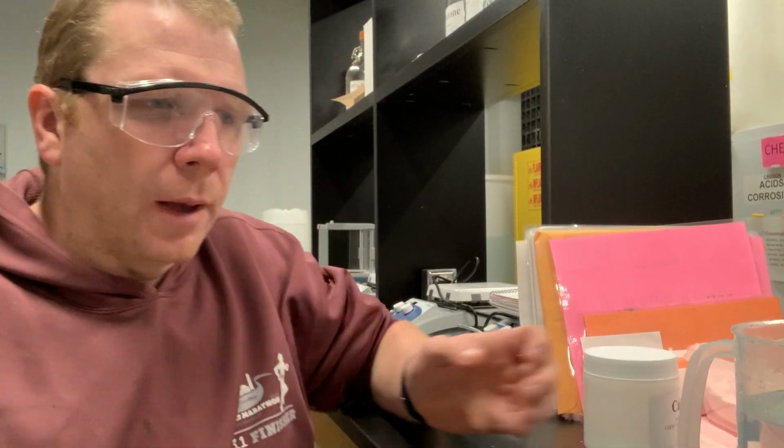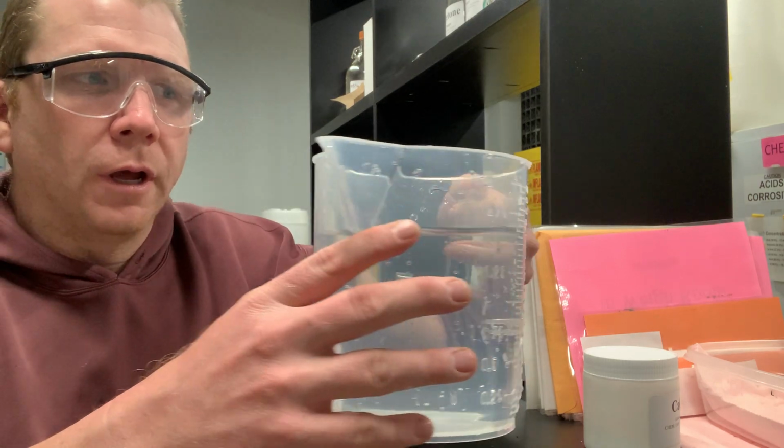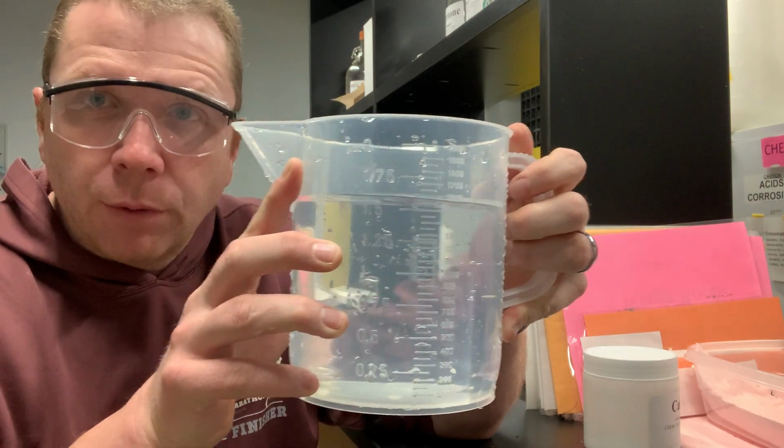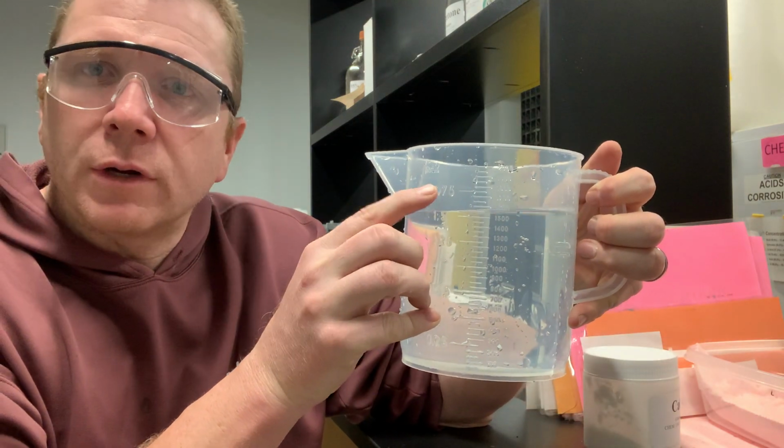In order to set up your apparatus, you need the following. You need a 2-liter pitcher. Now, if you notice, I haven't filled this all the way up to the brim. It's just a little bit below, or it's between 1.5 liters and 1.75 liters.